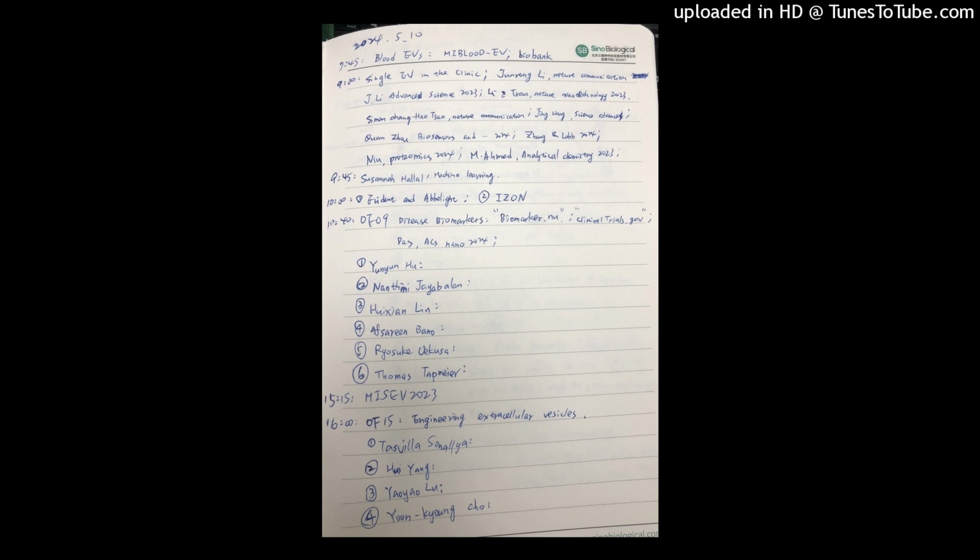Not only that, the GDM adipose tissue EVs upregulated the expression of genes associated with glycolysis and metabolism in the liver cells. So this made us think, what could be this factor associated with EVs that is contributing to this? We were particularly interested in studying the microRNA profile of these EVs. So for that, we isolated RNA from both the adipose tissue and EVs from normal and GDM pregnant women, performed small RNA sequencing, and did some comparative study.